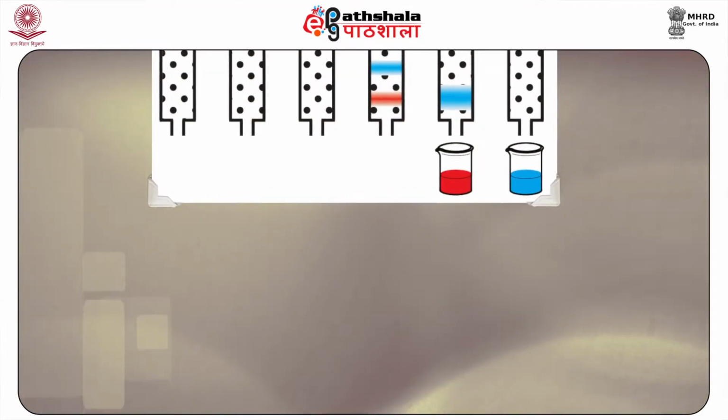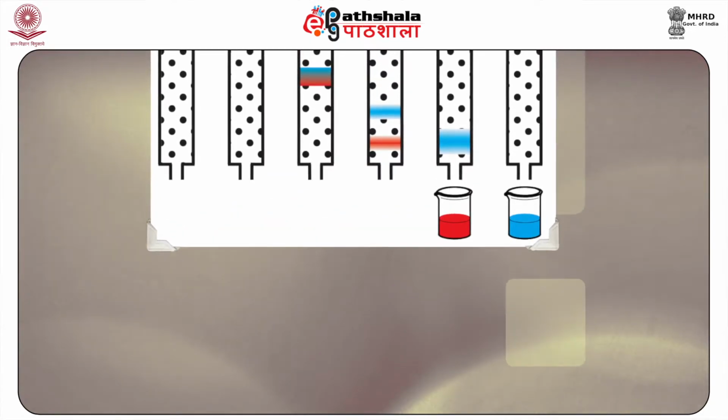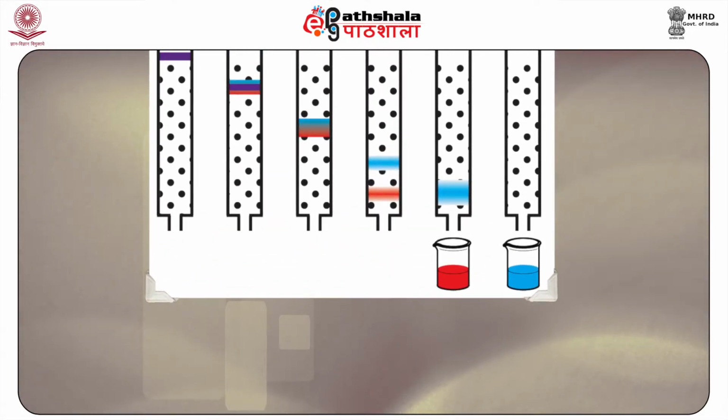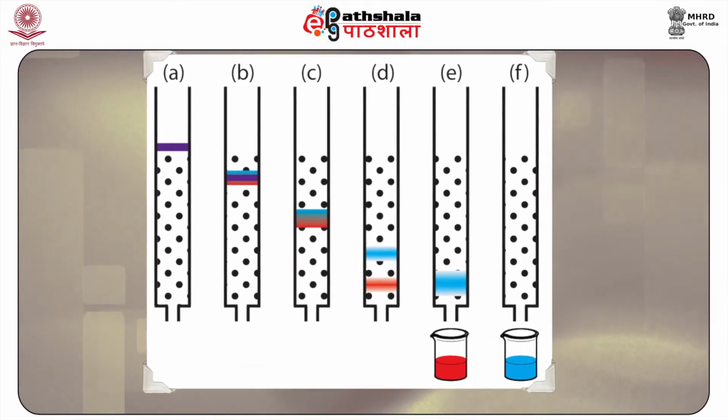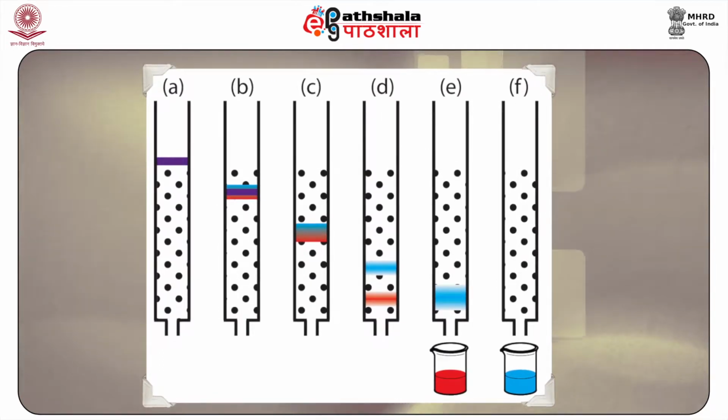Here, both mobile and stationary phases are either liquid or may have liquid as a stationary phase and gas as mobile phase. The liquid exists as a thin layer on a solid surface and acts as a stationary phase. The analytes that are polar in nature diffuse and get retained into a stationary water layer associated with the polar stationary phase.